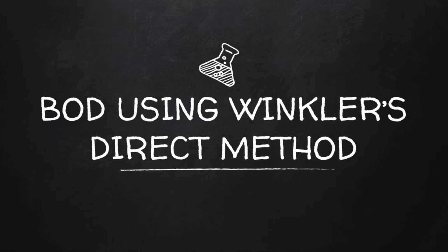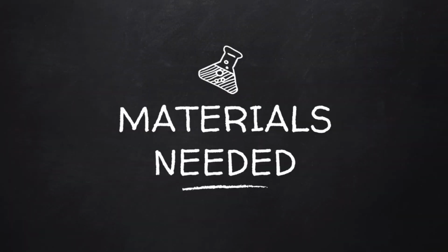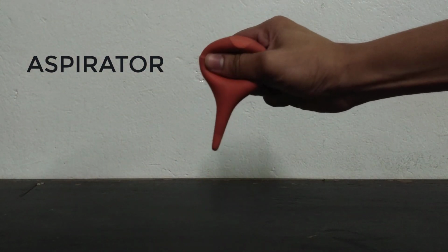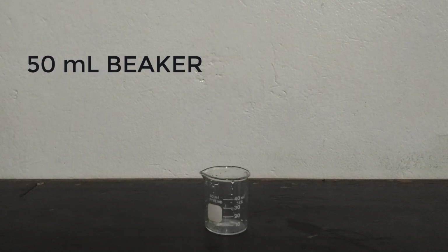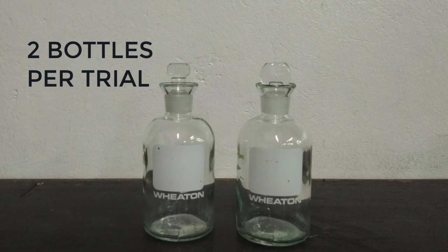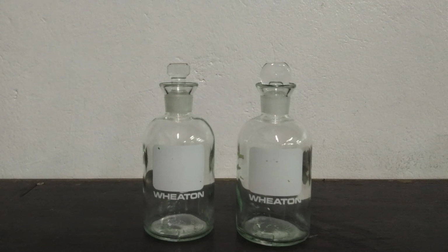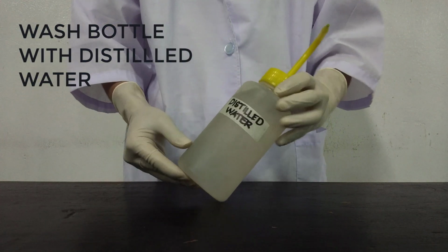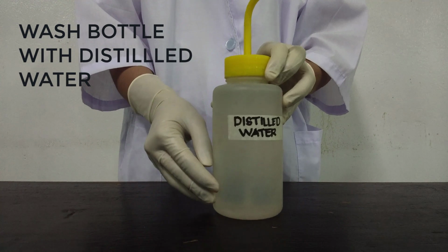Process of finding BOD using Winkler's direct method. The following are the materials that we need for this experiment. We need aspirators, 50 ml beaker, 300 ml BOD bottles, 2 bottles per trial. The first one would be for the initial BOD level and the last one would be the BOD level after 5 days. Wash bottle with distilled water.